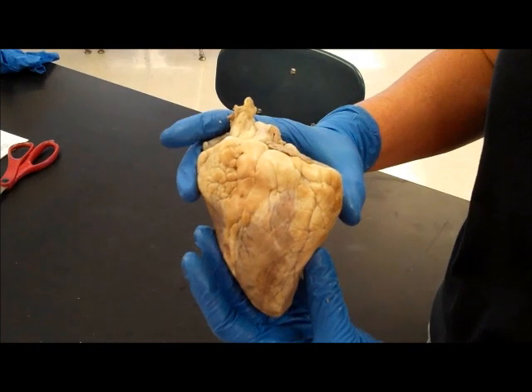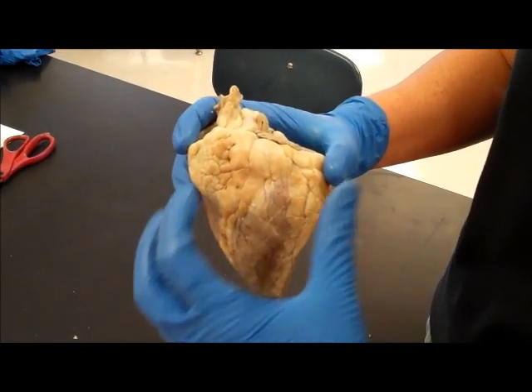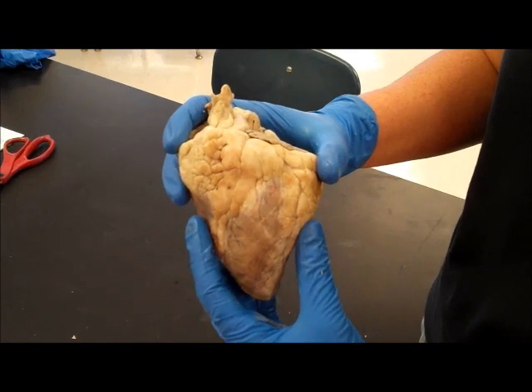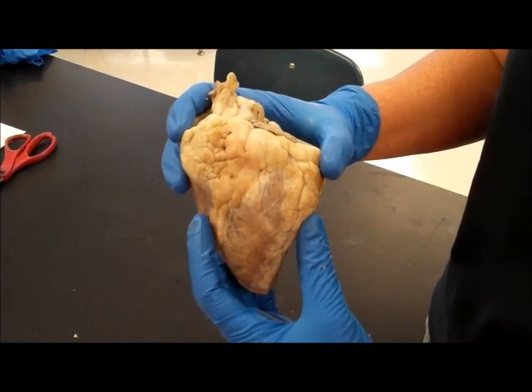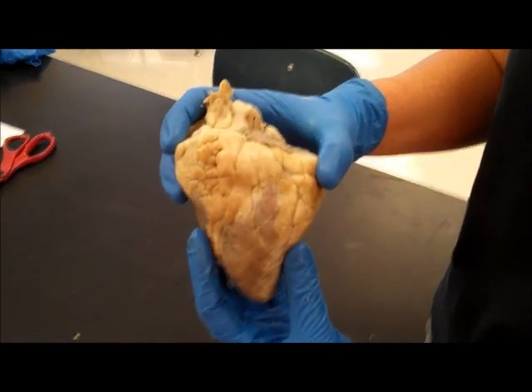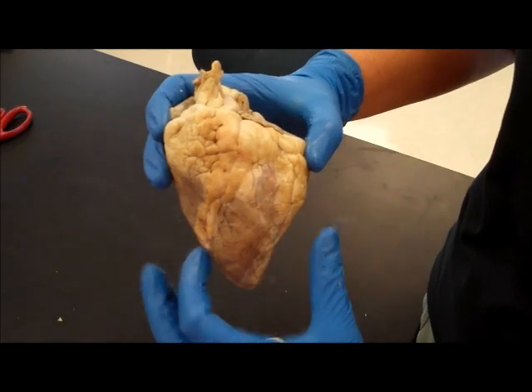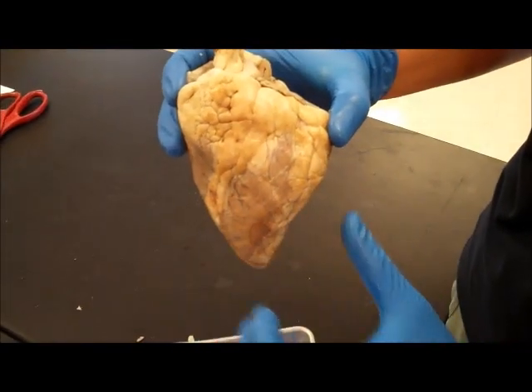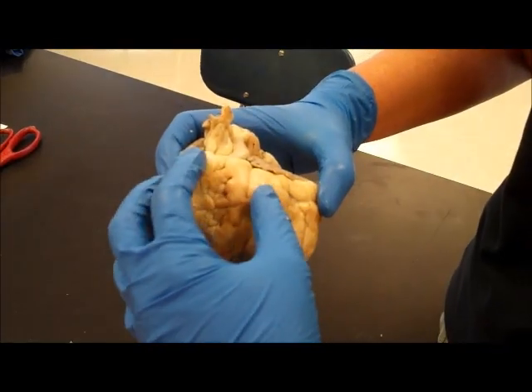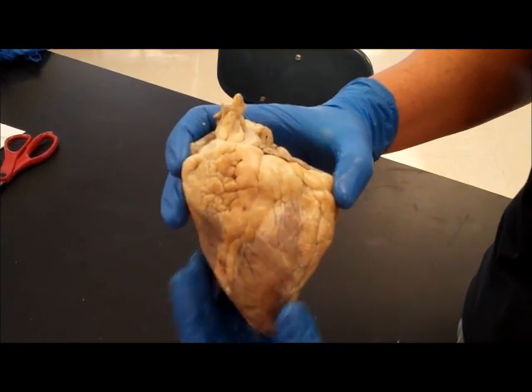Okay, what we have here is a sheep heart, and this is how you would see the sheep heart if you were looking at the front of the sheep. This is the ventral view of the sheep heart, and if we examine the external surface of that heart, you'll see a lot of white here. This white is fat on the heart.